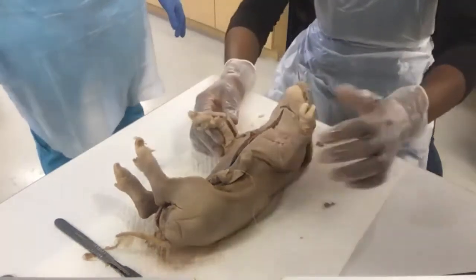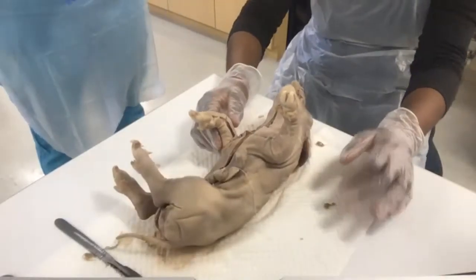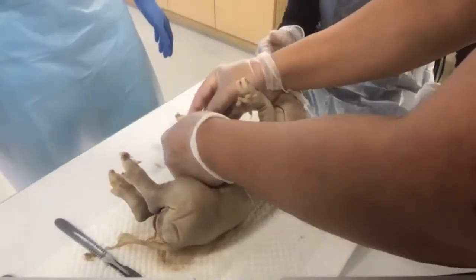Right, myocardium versus pericardium versus endocardium. They all felt very, very different. So now let's look at it specifically. Now, you open this up.